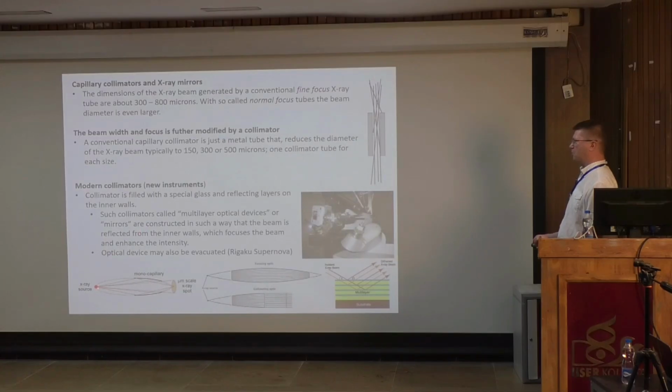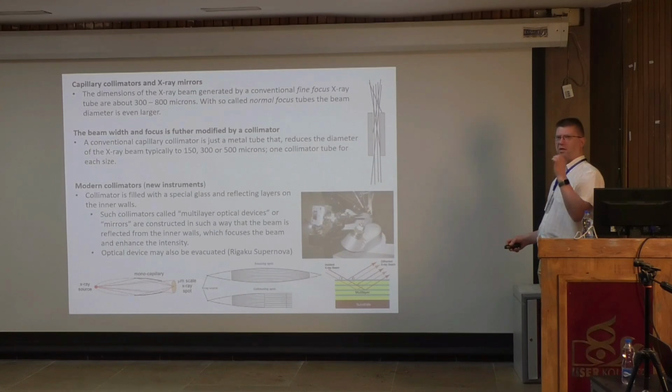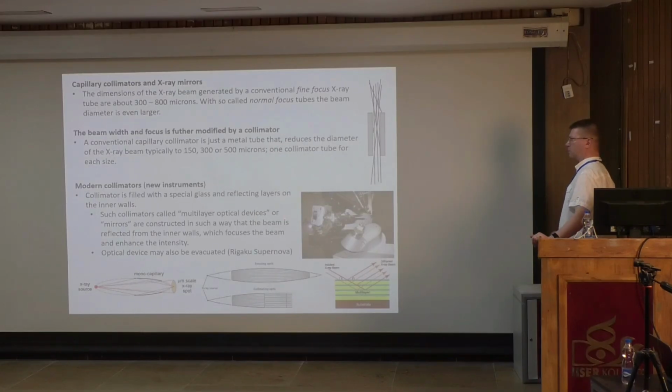And then this is the idea. So it comes here with the X-ray source. Now it's the capillary that will focus all these things, and we will have a new focused beam. It's much brighter because it's been focused. And then the other radiations are out. The one thing which is coming out is pure radiation, what we want. And that is the idea of that. This is the new modern instrument.